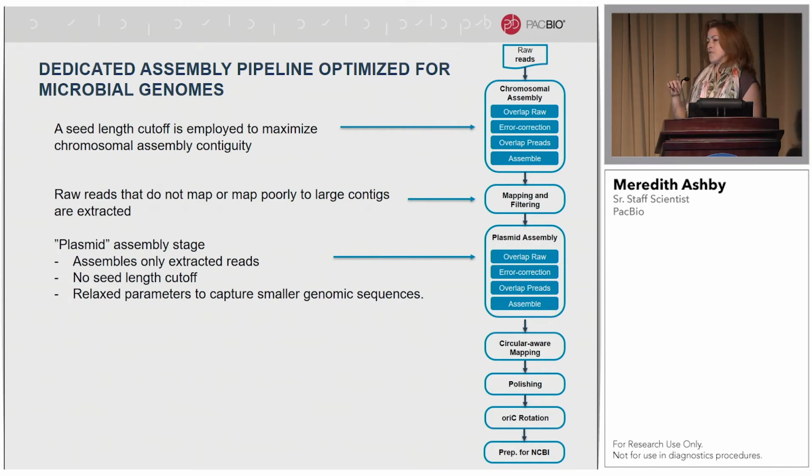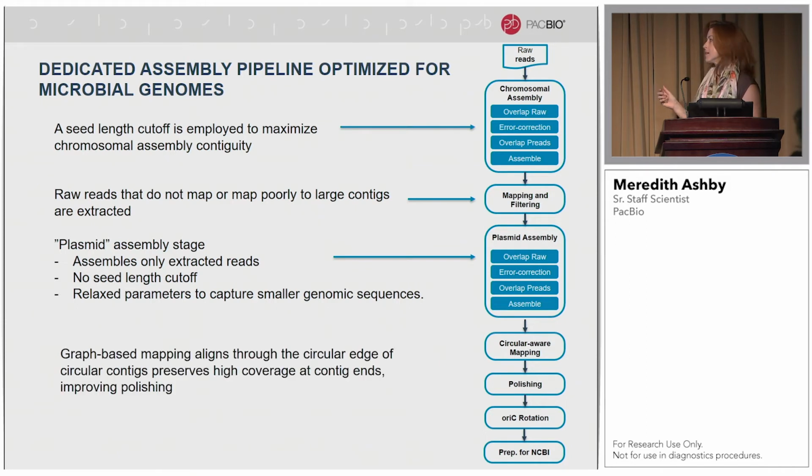For this stage of the assembly, there's no seed length cutoff, and the parameters are optimized in order to capture smaller genomic sequences. It used to be you had to dig through the reads and do that yourself. Now we do it for you.